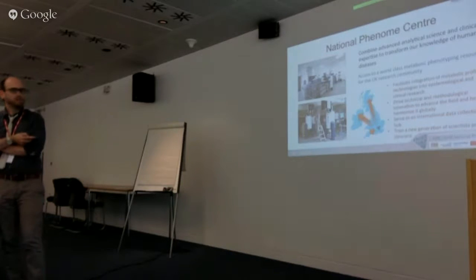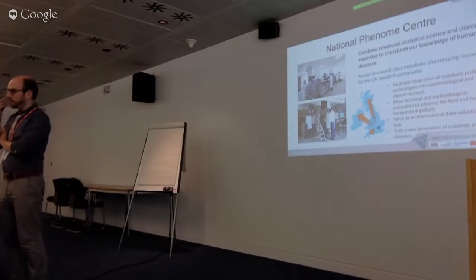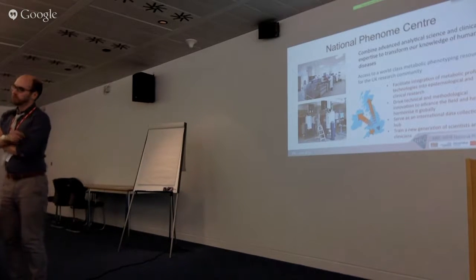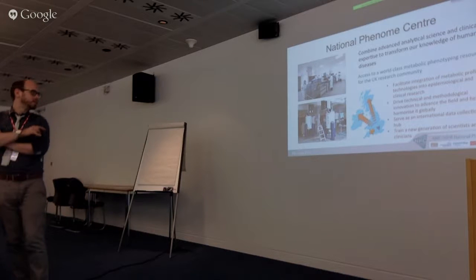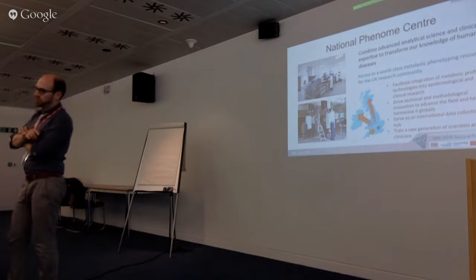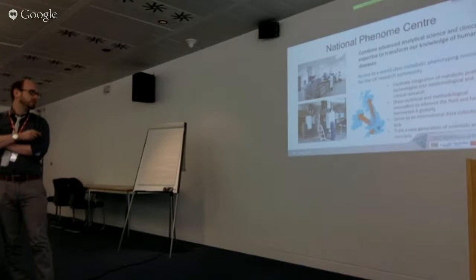So National Phenome Centre, we're a collaboration between the MRC and the NIHR, obviously coming out of the old Olympic drug testing facility. In all honesty, there's very little of that in the NPC, but it makes for a good story. So we've got a lab at Imperial College, unfortunately split across 2 sites. So we have NMR in South Kensington and a mass spectrometry lab in Hammersmith Hospital, and that's something that's actually become quite significant to us.